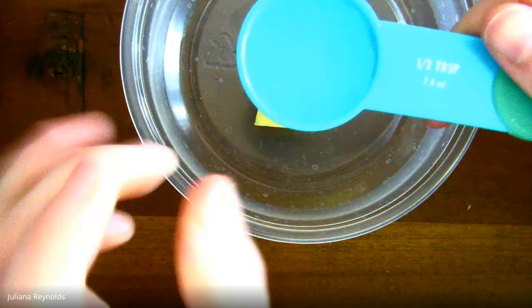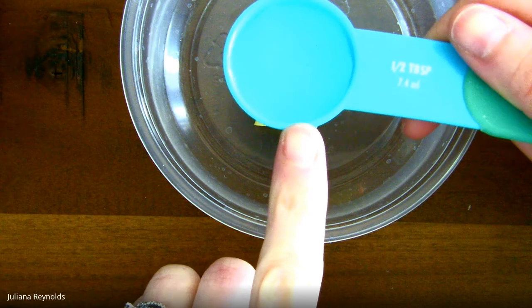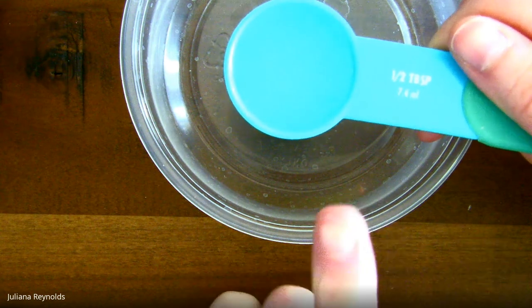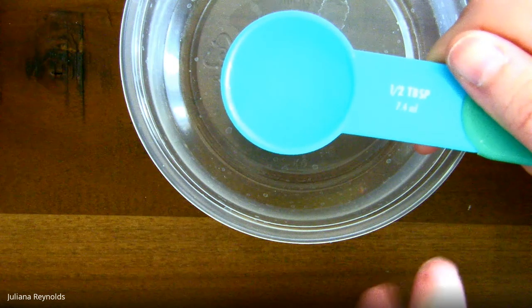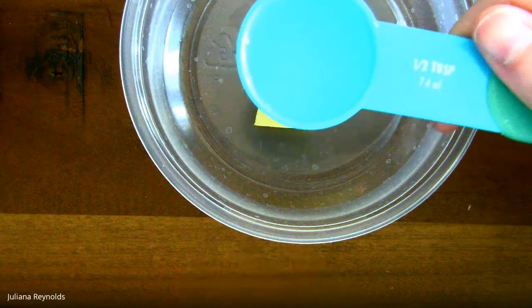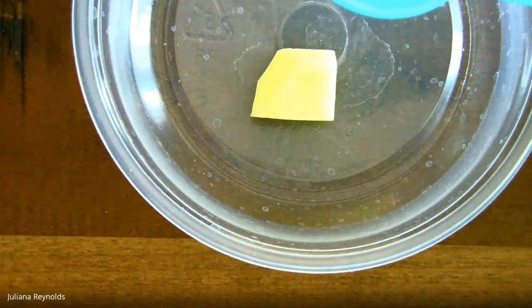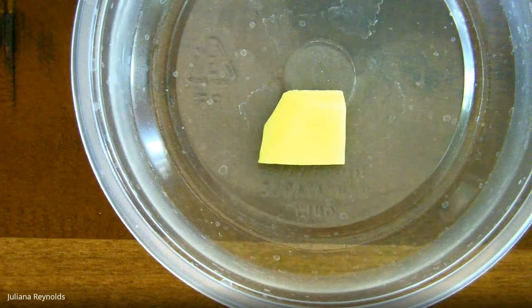Okay, so it's translucent. It looks kind of like water. It's a similar kind of color. Of course, this is not water. The chemical formula for hydrogen peroxide is H2O2. So it has an extra oxygen atom. I'm going to go ahead and pour the hydrogen peroxide on the potato, and then we'll see what happens. Okay, let's try it out.